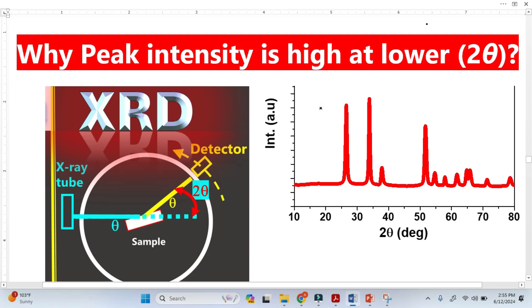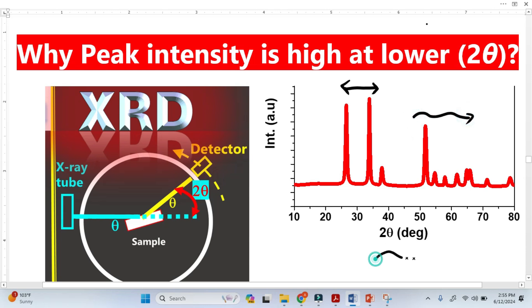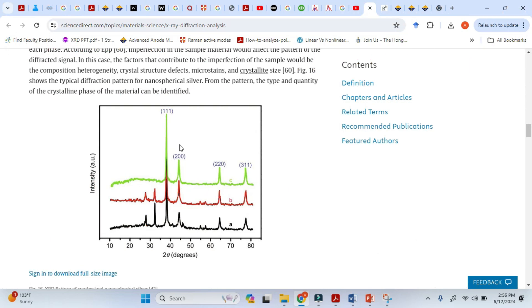In XRD analysis, it is commonly observed that the peak intensity is higher at lower 2-Theta, and this intensity decreases when the 2-Theta increases. Here we can see that peak intensity is high at lower 2-Theta. In this diagram, we can see that the peak intensity is higher at lower 2-Theta and the intensity decreases when the 2-Theta increases.